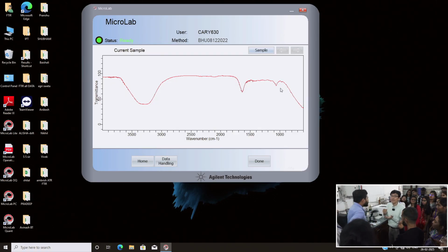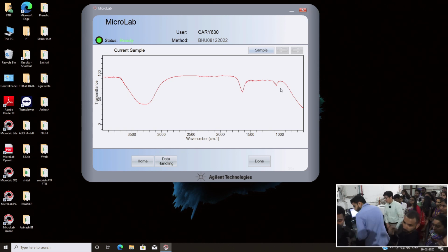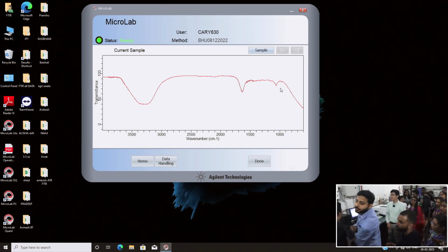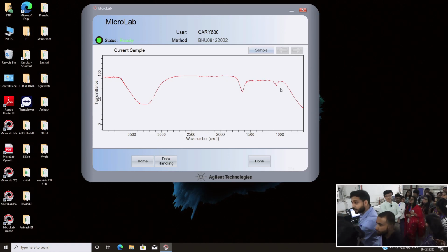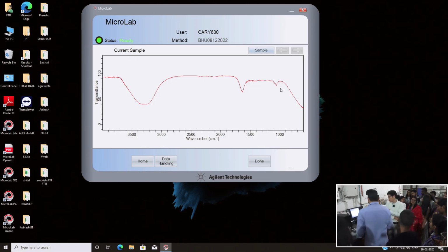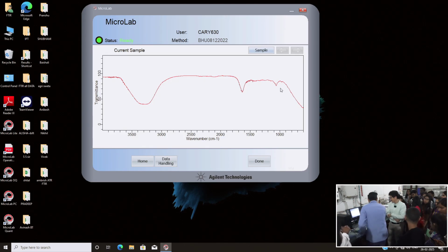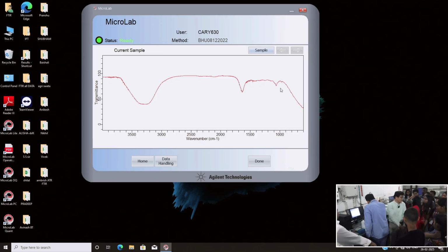Please heat up and put it in hot water, and solubility increases, so you can prepare a high concentration sample. Okay, just a moment. So, would you measure the water spectrum first? Okay, again, let's measure the water spectrum as a first step.